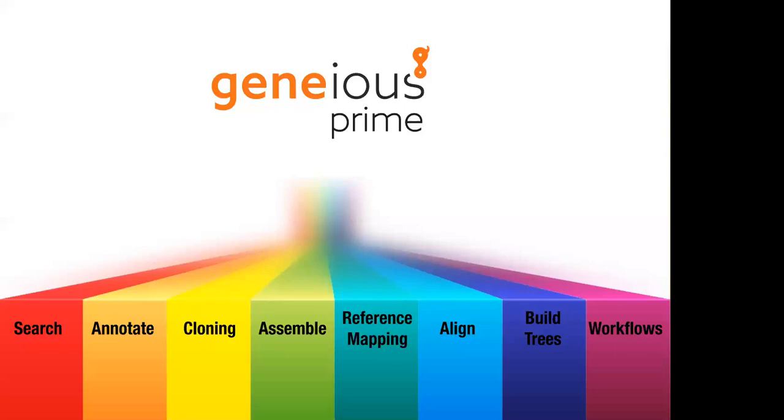Do pre-processing, so things like trimming off bases based on quality scores. For NGS data, there are some additional tools like error correction, normalization, deduplication, kind of those data QC steps. And then you can do de novo assembly, or you can map your reads to a reference sequence. And then you can do downstream analyses like finding where any variations or SNPs are. You can also do basic RNA-seq expression analysis.